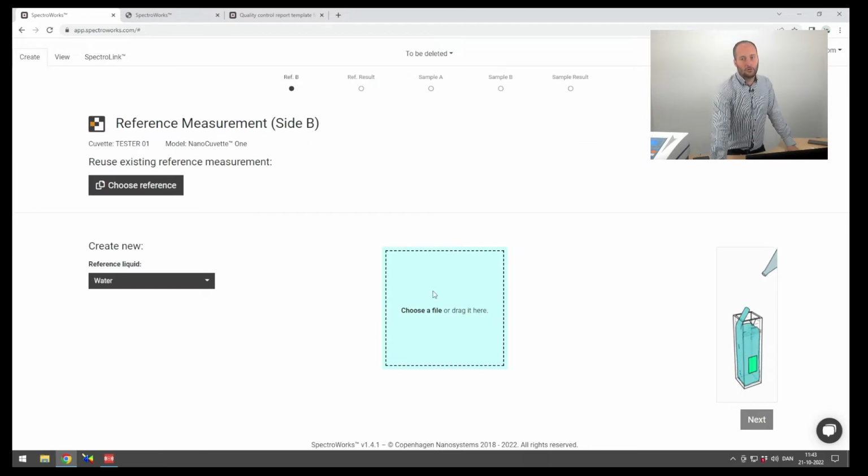Effectively, you do the experiment with the software for Motion Insight, save it as a CSV file, and then drag it in here. So you don't need the link. It just cuts away the requirement of logging into multiple software at the same time and doing the data transfer. So it makes sense during the demo stage with the customer to work this way.